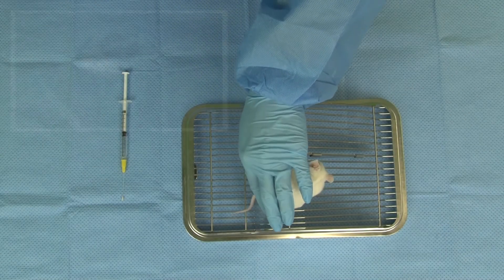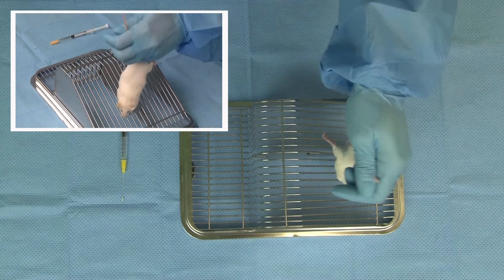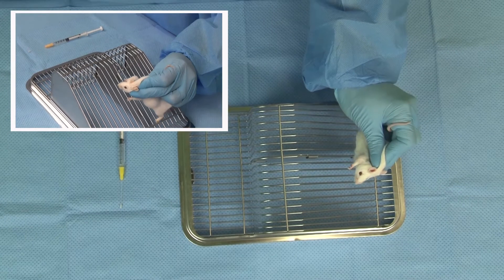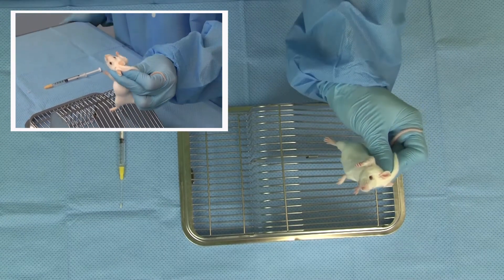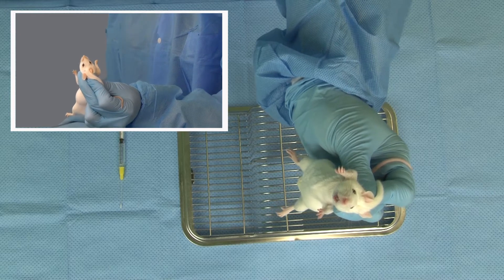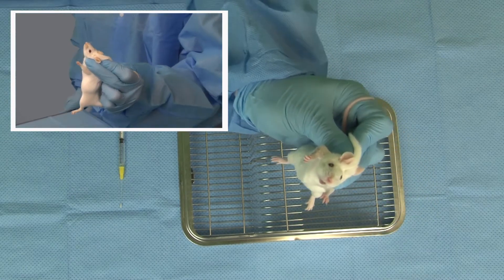Gently but firmly grasp the mouse by the base of the tail. Then use the thumb and index finger to gently grasp the nape of the neck, holding on to the mouse by the scruff. Then confidently lift the mouse by the scruff and hold the mouse in an upright position.